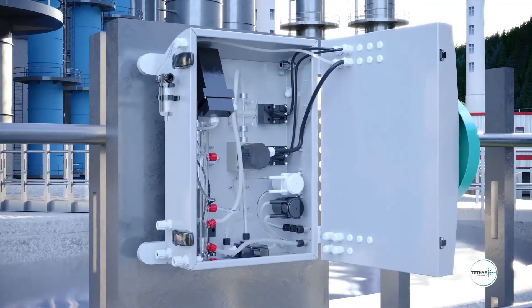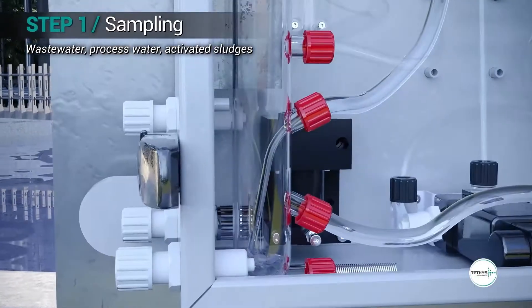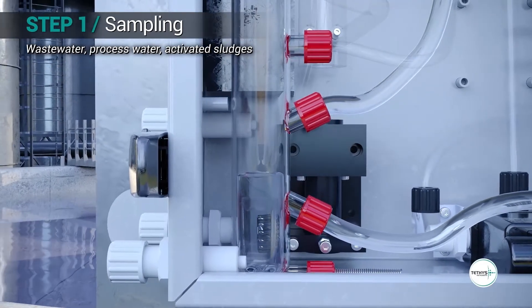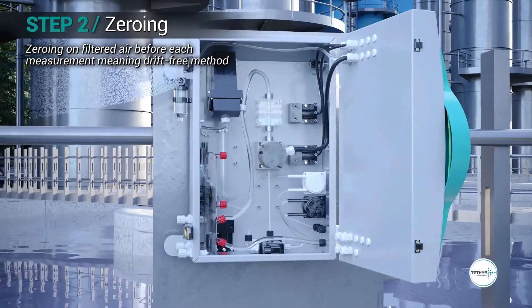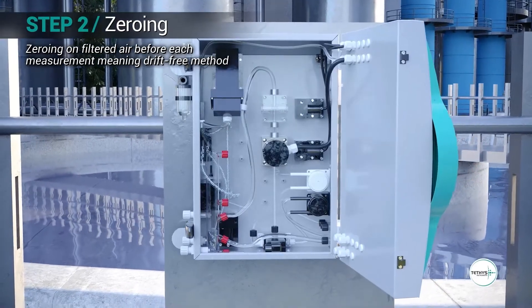The measurement cycle includes five steps. The analyzer pumps the sample without the need for sample filtration, even for highly turbid activated sludge. The analyzer then performs an automatic zero on filtered air from outside before each measurement, which avoids any zero drift.